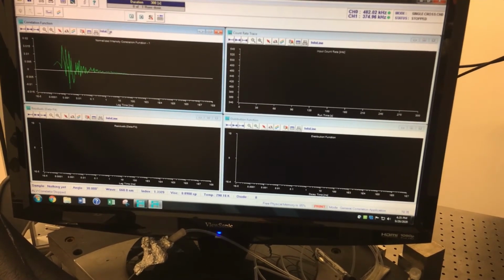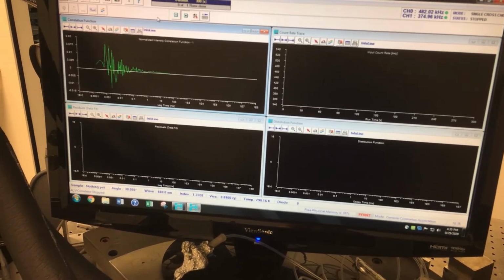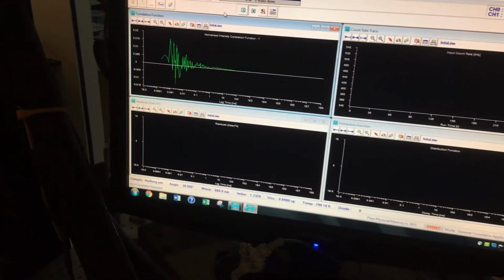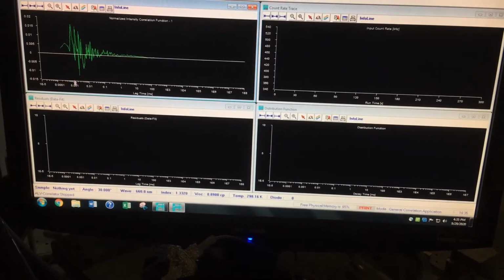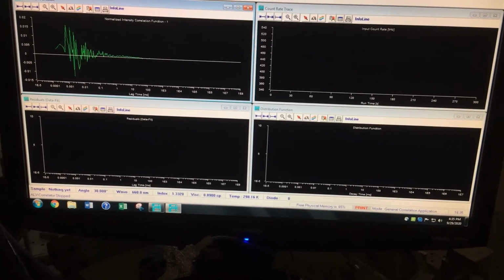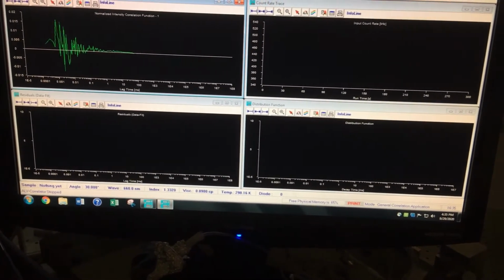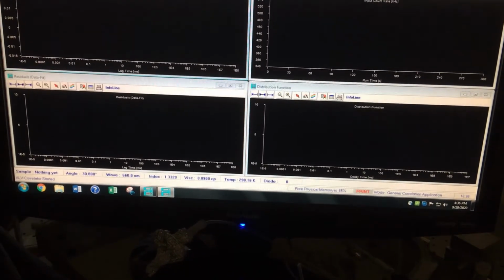So I'm going to restart this. Let's kill the lights first in this room. And I think that's okay. And we'll start the correlation function. And it does a little bit of auto scaling first.